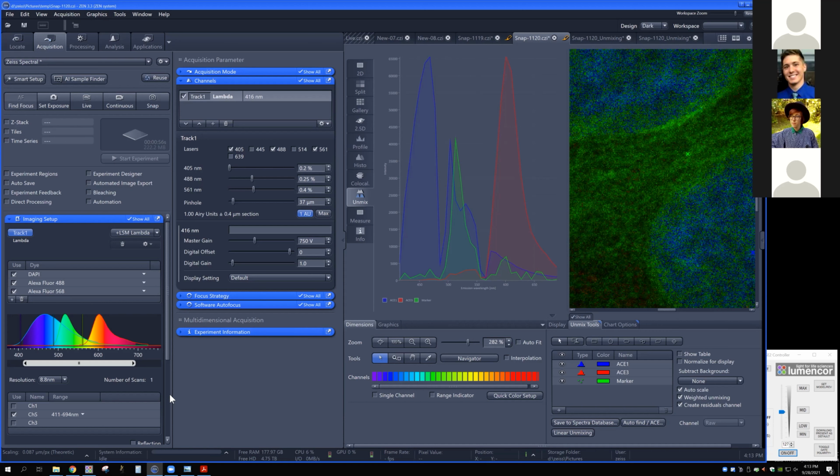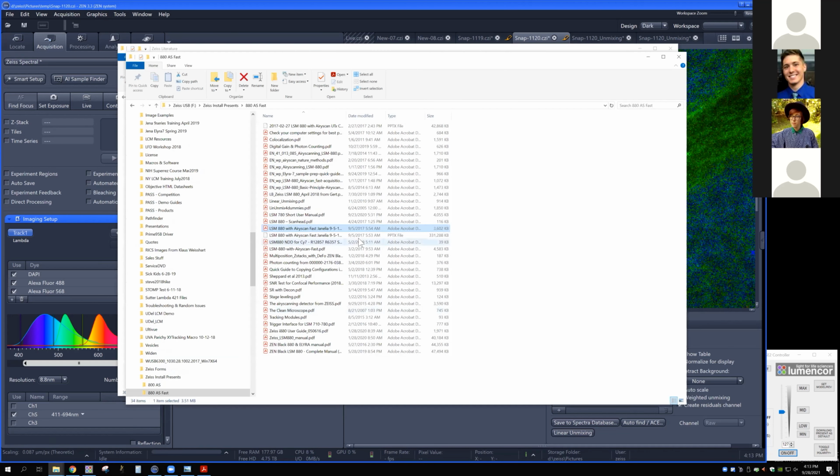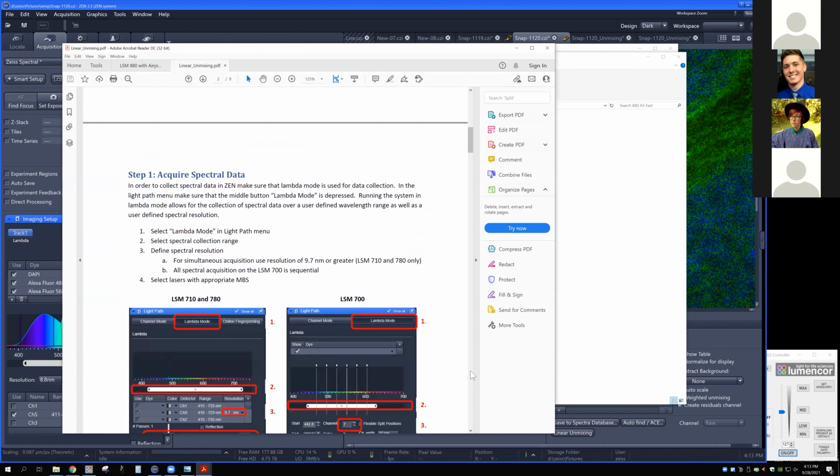If anybody wants any math on any of what we've talked about here as well, I do believe I tried to leave behind for you an unmixing guide as well. Do I have that here? Let me check the other folder. I will make sure that you have it anyway. You should have it. Ah, there we go. Okay, yeah, there's a couple. So linear unmixing or linear unmixing for dummies. Can't quite remember which one is going to have all of these different pictures for you.